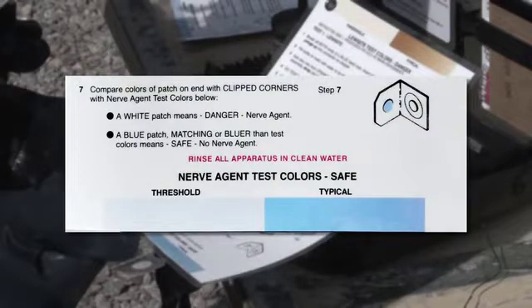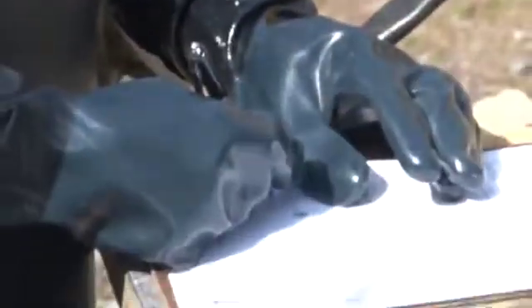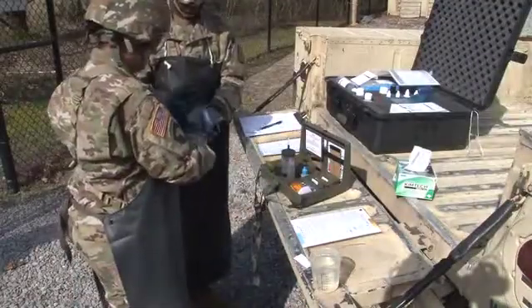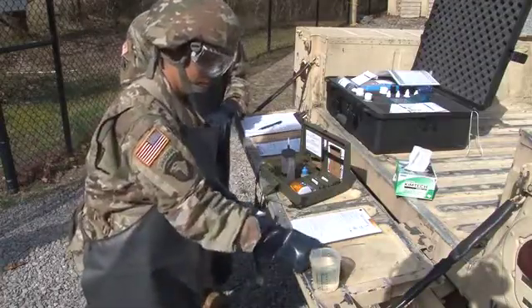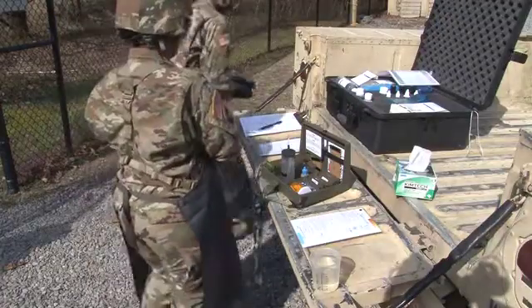If your ticket is white, indicating the presence of a nerve agent, report the results to your supervisor or CO. Record all your testing results accordingly. Upon completion of your tests, you will rinse any used test hardware with potable water. Perform your after operations PMCS and return all items to their proper locations in the kit.